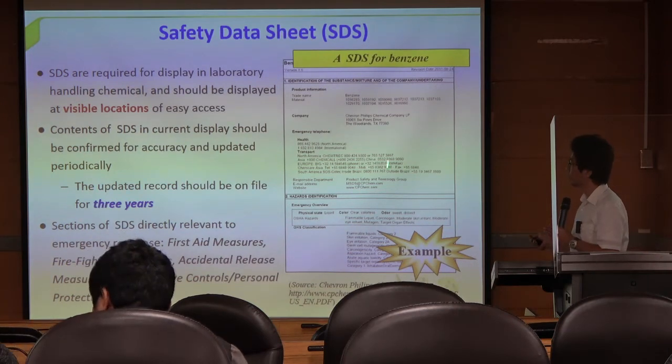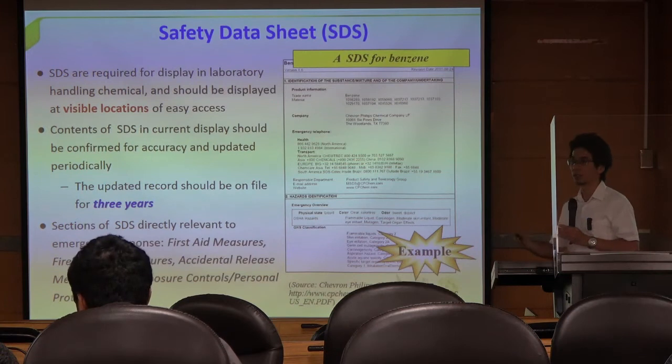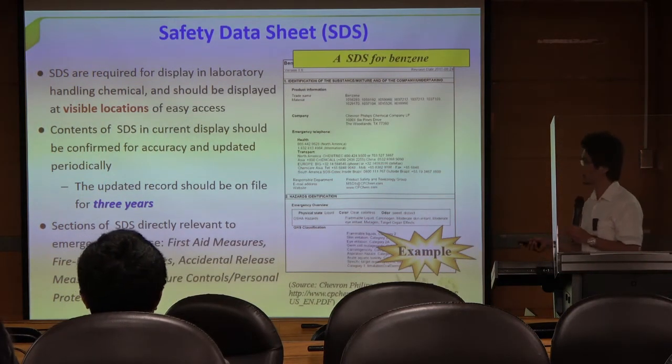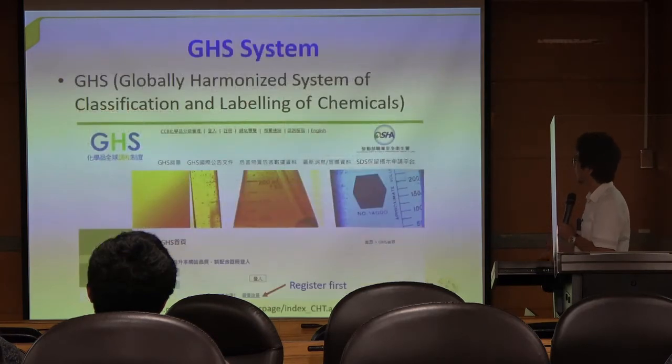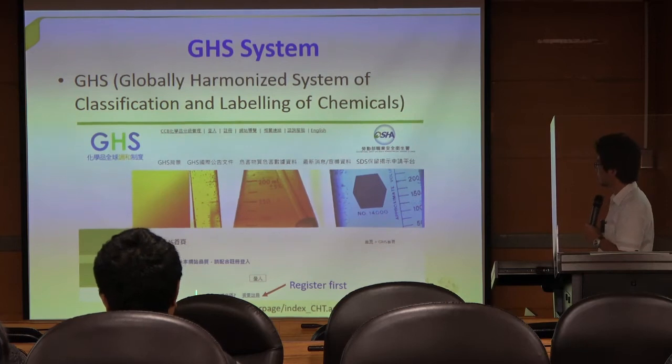The GHS will update the SDS, then you need to update that. But I think during your stay at NTSD, knowing the SDS of your major reagents is enough.